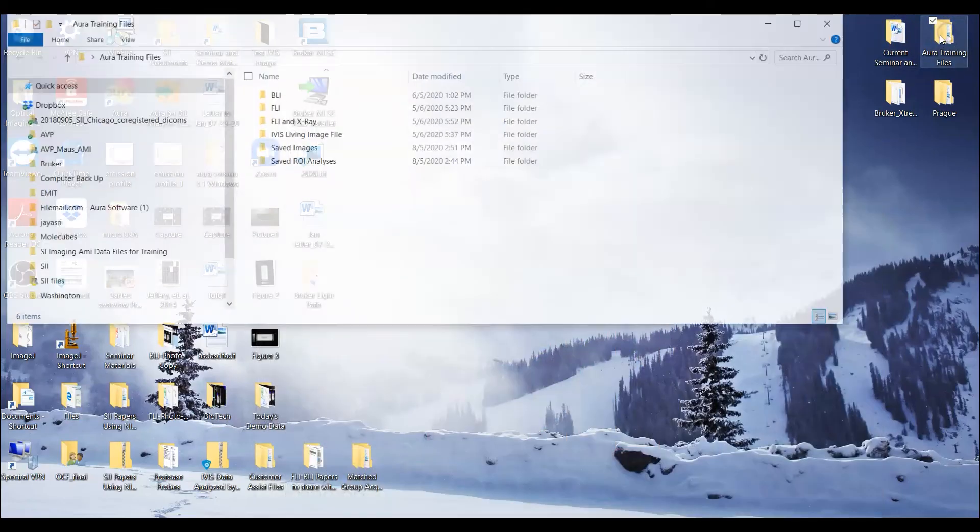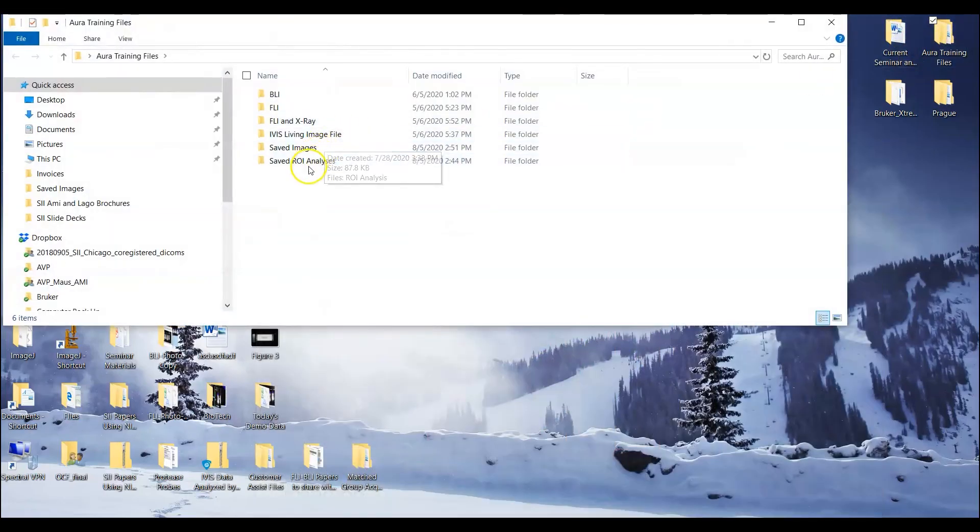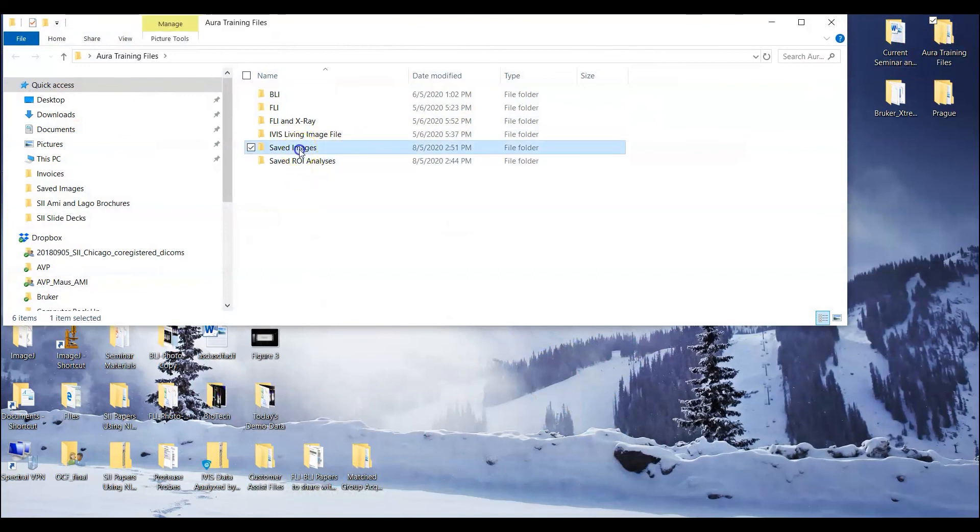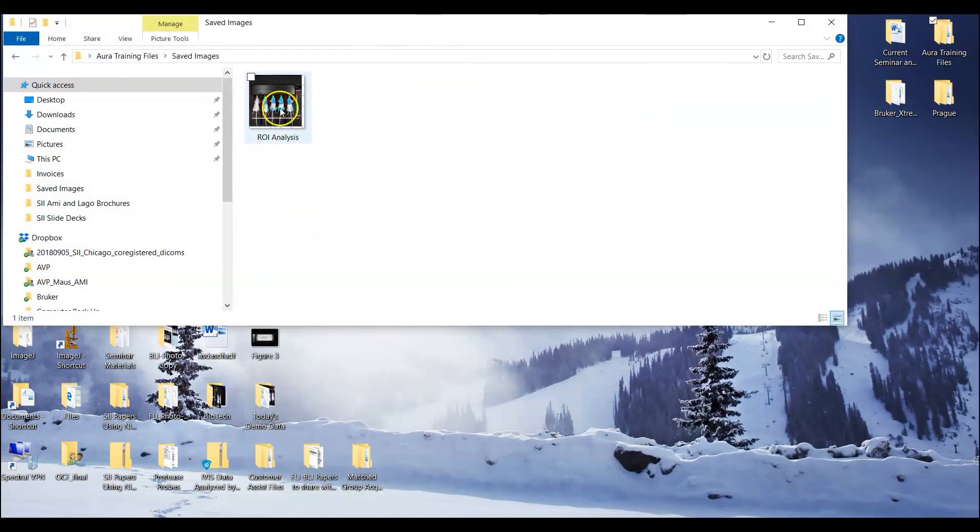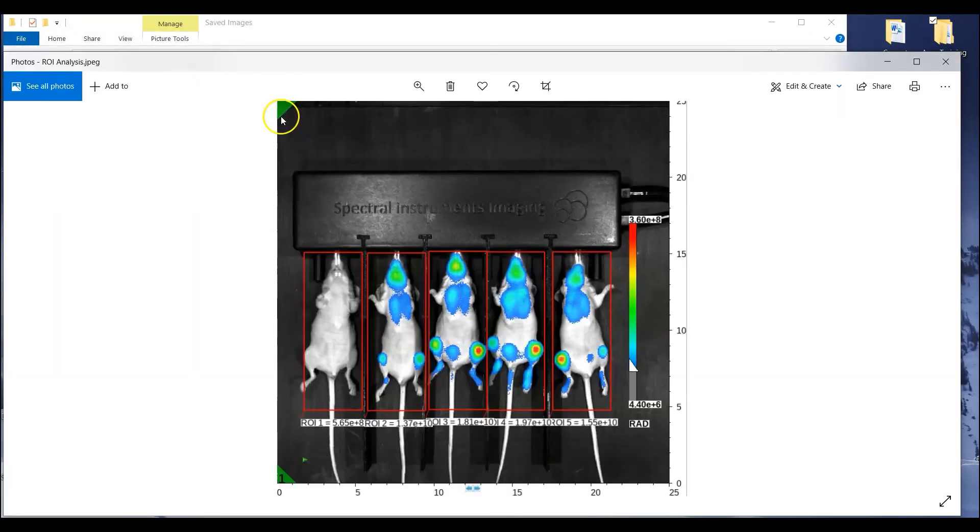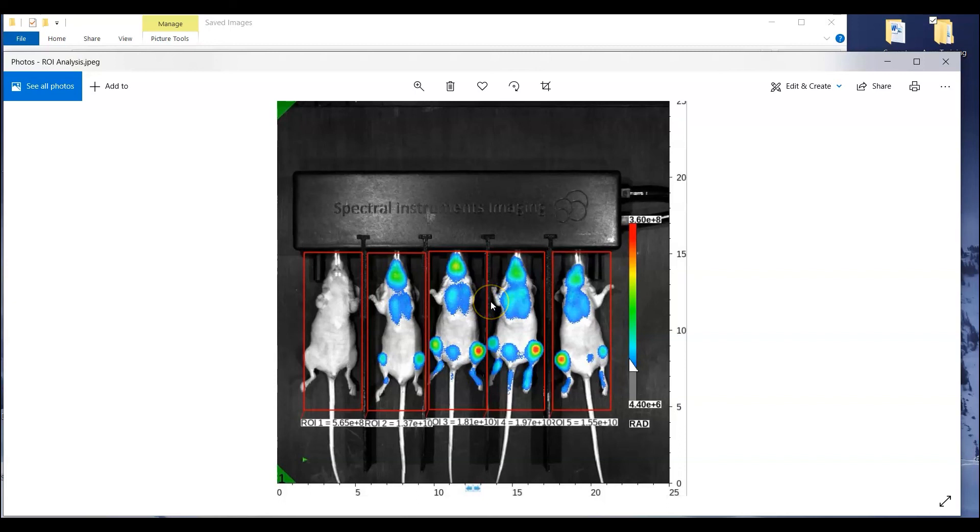And just to demonstrate this we can minimize the window, go to the folder where the image was saved and there we are. Okay so this would be the image that you could then import into any kind of presentation for the purposes of explaining your ROI analysis.